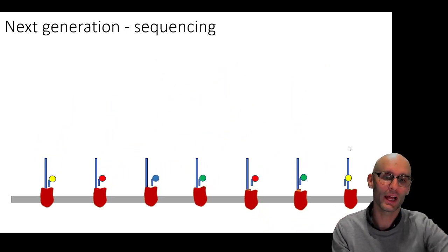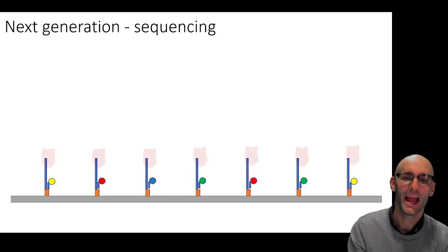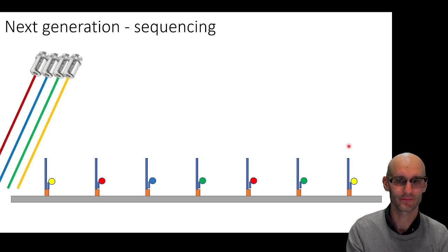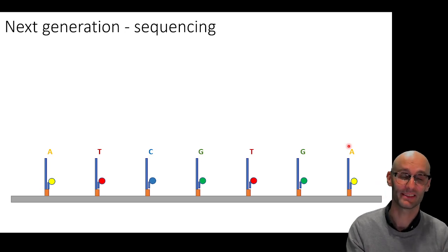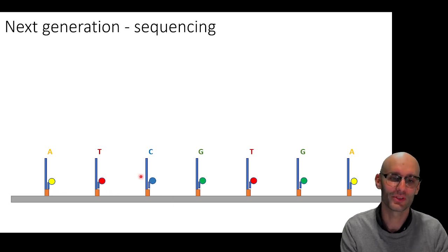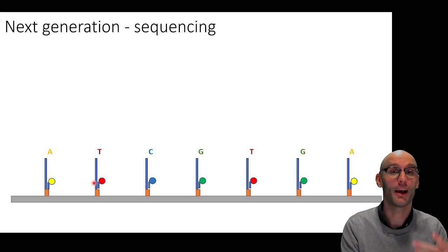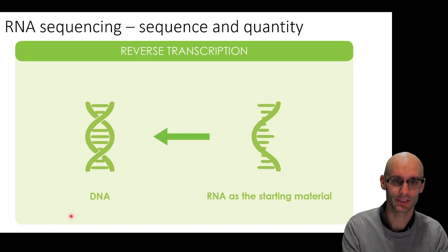So we incubate all our nucleotides along with our DNA polymerase. We can run it all simultaneously, and now we run our multiple laser colors along the top there. Here they go, bing, bing, bing, bing, bing, bing, bing. And so now we can build up our sequences. So you can see very rapidly each cycle, and now you chop your fluorophores off, and then you do another cycle and another cycle. Very quickly, in 70 cycles, you'll get all your fragments done, rather than having to do four nucleotide types per fragment. So multiple colored lasers really accelerated the next generation sequencing.